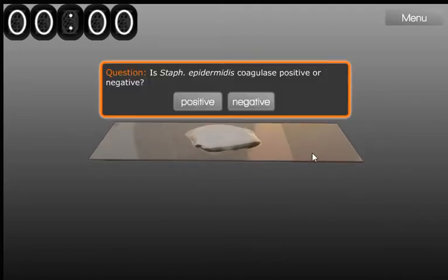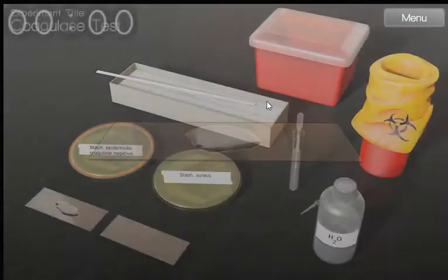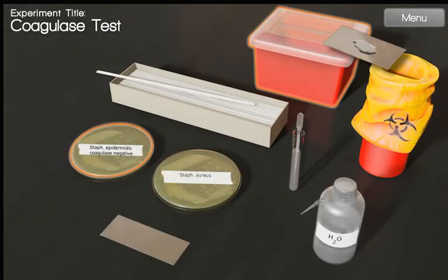Now we cannot see any changes in the drop and we choose the negative result. This is the correct answer.